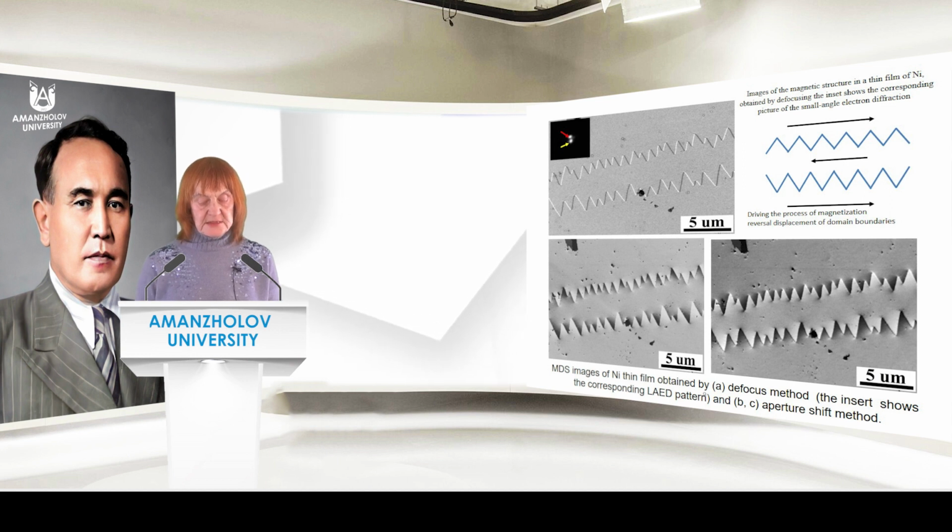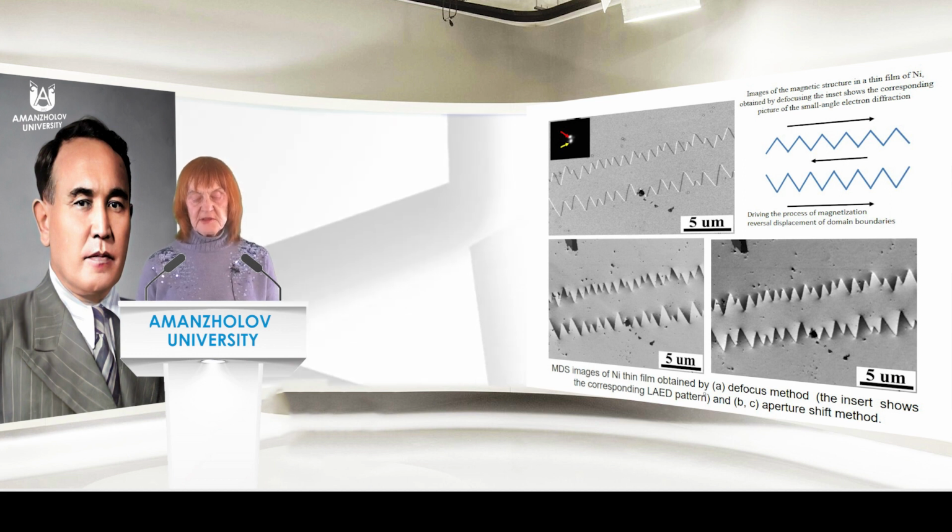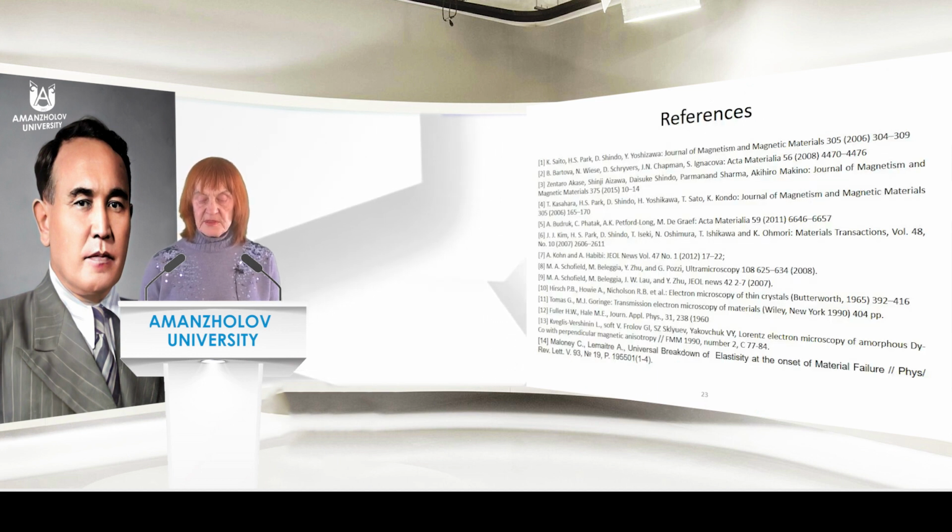We demonstrated the capabilities of the Hitachi HT7700 for magnetic domain structure study of thin films.